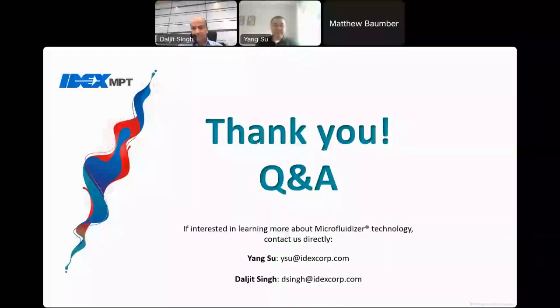The next question is, can the microchannel withstand such large pressure considering the viscous flow? Yes. Our system, including the microchannel, is designed to withstand that pressure. They're rated for more than the achievable maximum pressure of 30,000 psi. So all the high pressure components, including the interaction chamber, are designed for it.